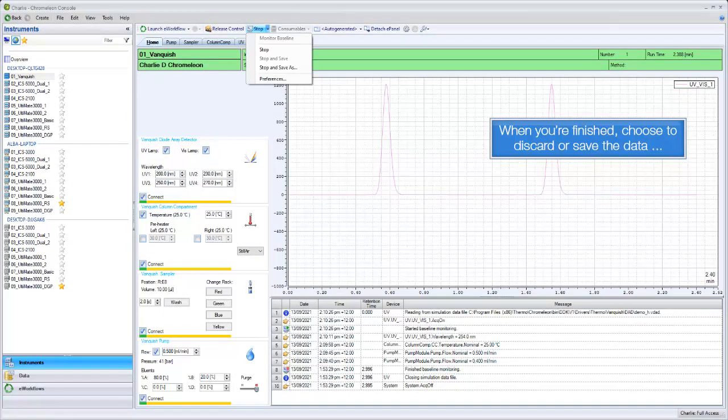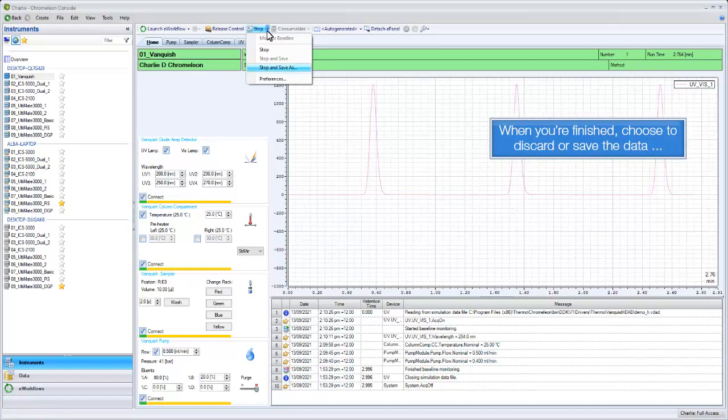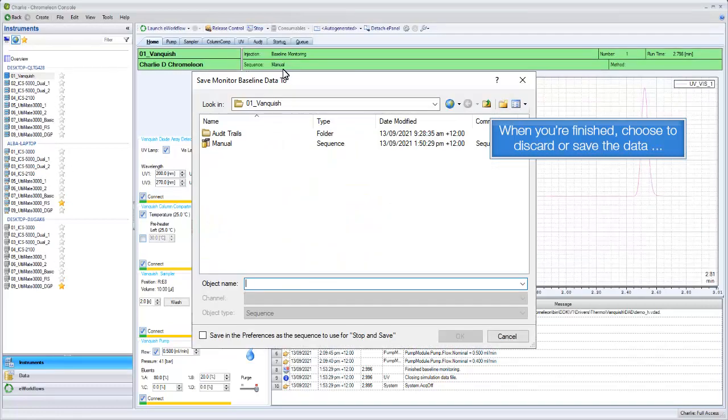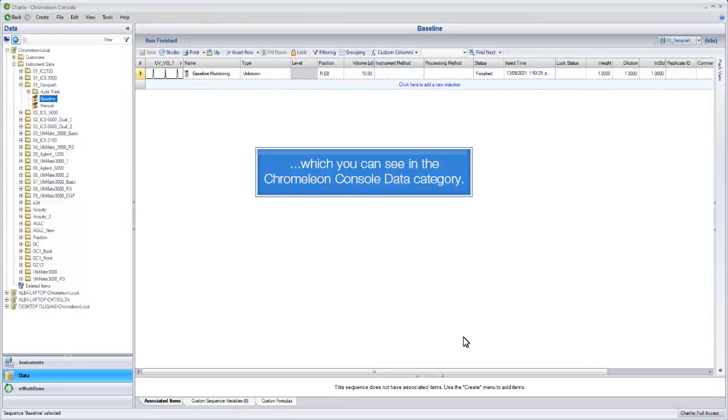When you're finished, choose to discard or save the data, which you can see in the Chromelion Console Data category.